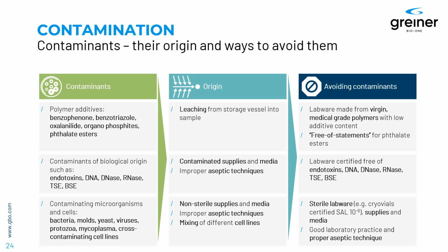The ways of fighting these contaminants here are to use sterile labware. There are certain levels of certification available. CryoVials can be obtained today with a sterility assurance level and certification of 10⁻⁶. I personally suggest this should be the gold standard today, and also supplies and media should be sterile. And last but not least, again, it's good laboratory practice and proper aseptic techniques that have to be applied in order to assure that such contaminations are not occurring.